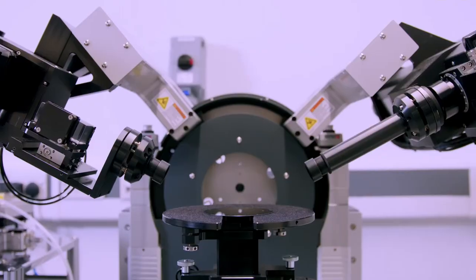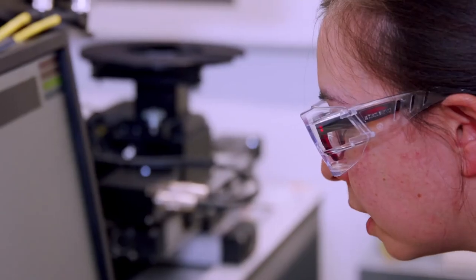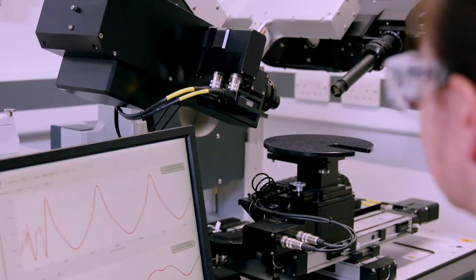This is an infrared ellipsometer which is quite unique because most of them have visible lasers on. That will give us information on our thin films but enables us also to do some depth profiling as well.